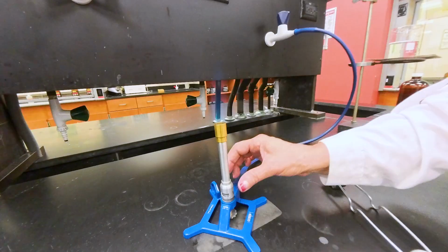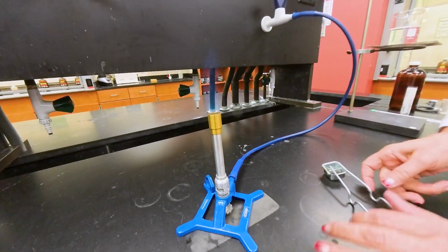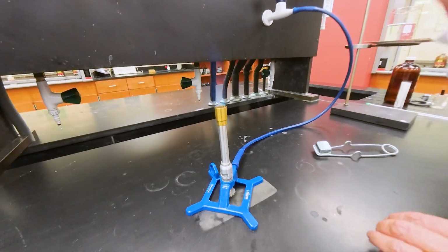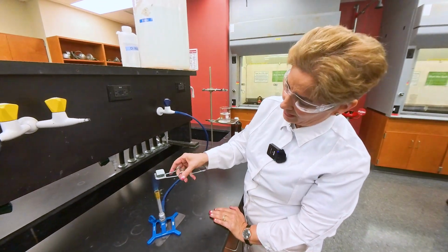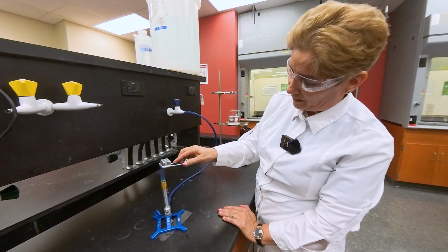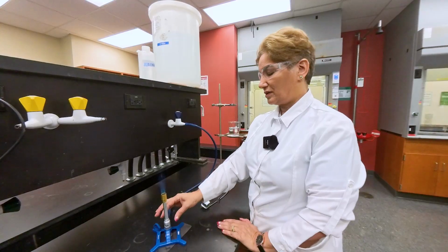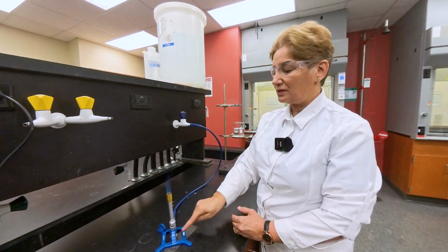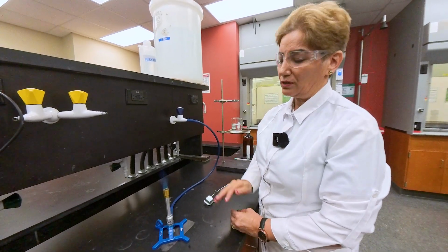You see, they're all blue, in different shades. The tip of the inner cone is the hottest part of the flame. So if you want a hot flame, make sure that the object or the level of what you are heating is adjusted to the top of the inner cone. For a cooler, lower temperature, you have to increase the distance. You can lower the amount of gas for a lower flame, but never a yellow color flame.